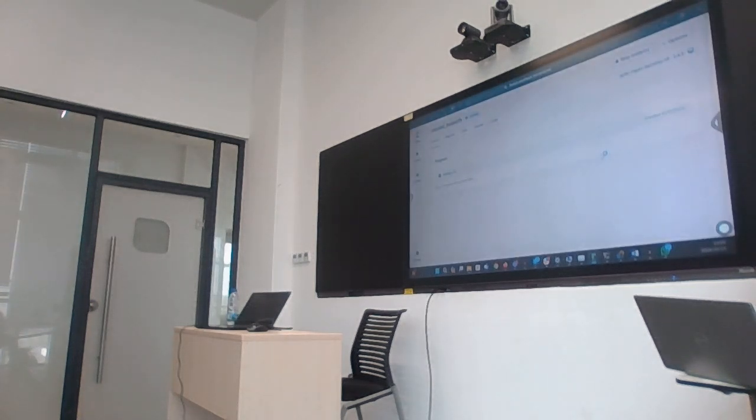And then you see this screen. If you don't see the screen, put up a red sticky. If you see the screen, put up a green sticky. If you're still busy, take down your sticky. Is it launching?